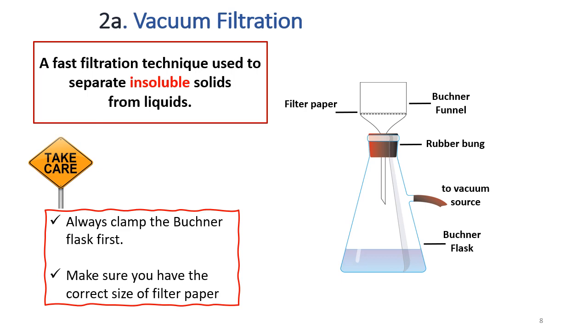In the second part, we said that we were going to discuss the different separation techniques. So we will either separate a solid which is insoluble from a liquid, or we will separate 2 different liquids. Then how can I separate an insoluble solid from a liquid? Of course, we used to do this by filtration.